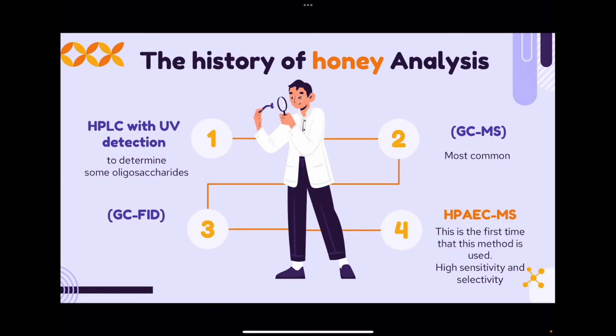But all of these methods were time consuming and required a lot of substance and materials, until they used HPAEC-MS spectrometry. They found it a more powerful analytical tool, highly sensitive and selective, and this is what makes it so great to use. And that's all about my part.